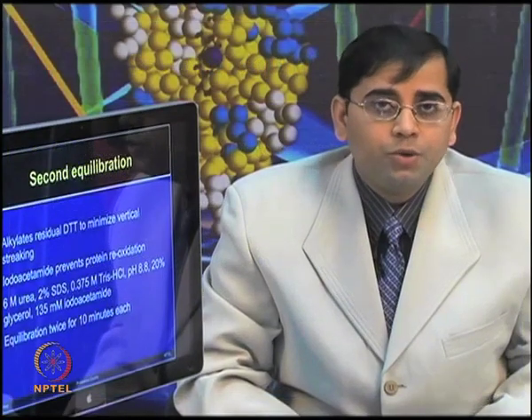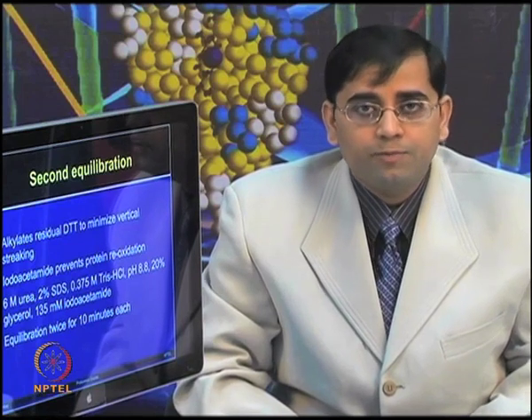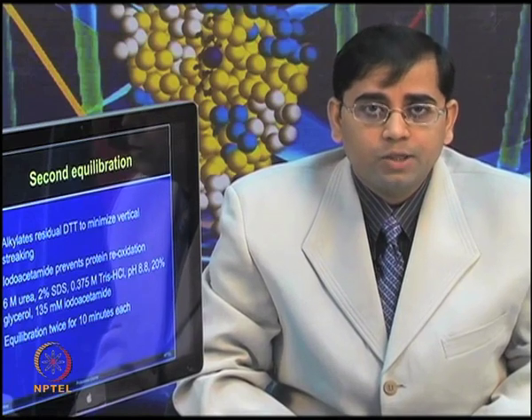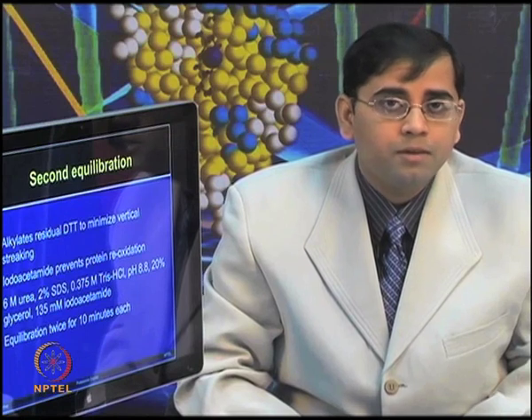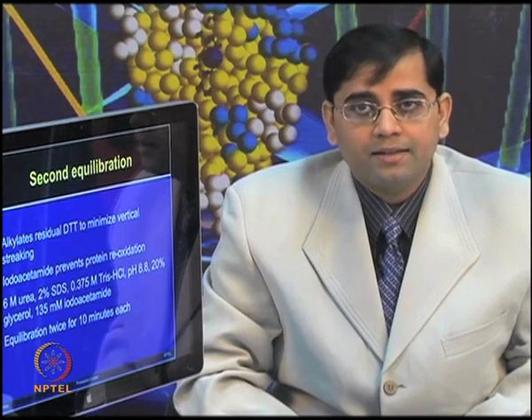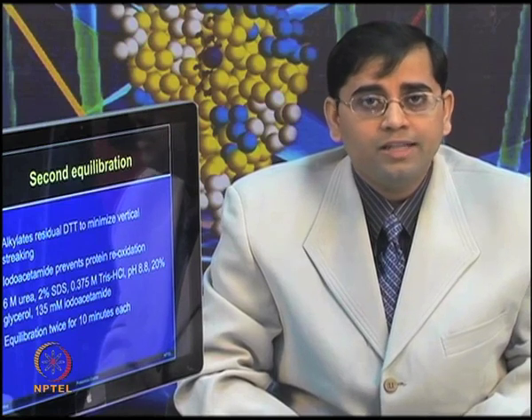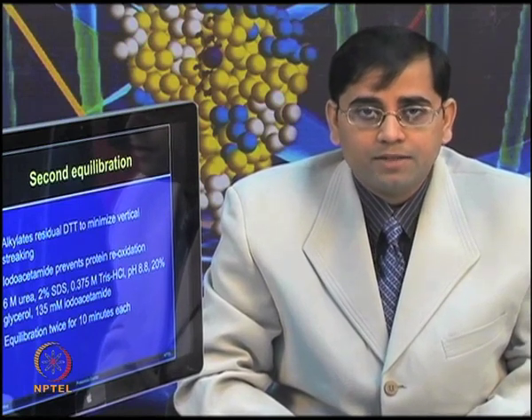So, you want to really ensure that your protein is denatured again after the IEF process. It is coated with SDS molecules, so that now you can separate the proteins in the second dimension based on molecular weight. This step is also performed for 10 to 15 minutes depending upon the strip length, and once both the steps are done, you are ready to perform the SDS-PAGE.